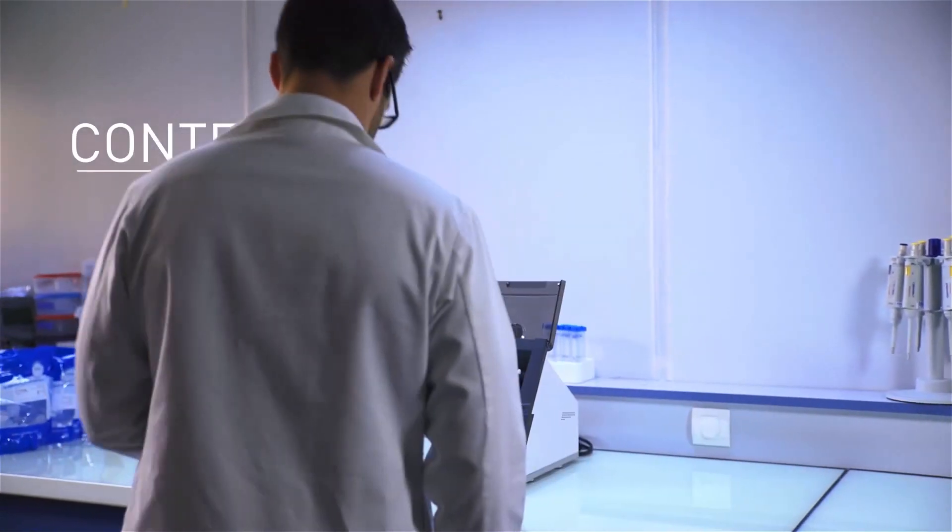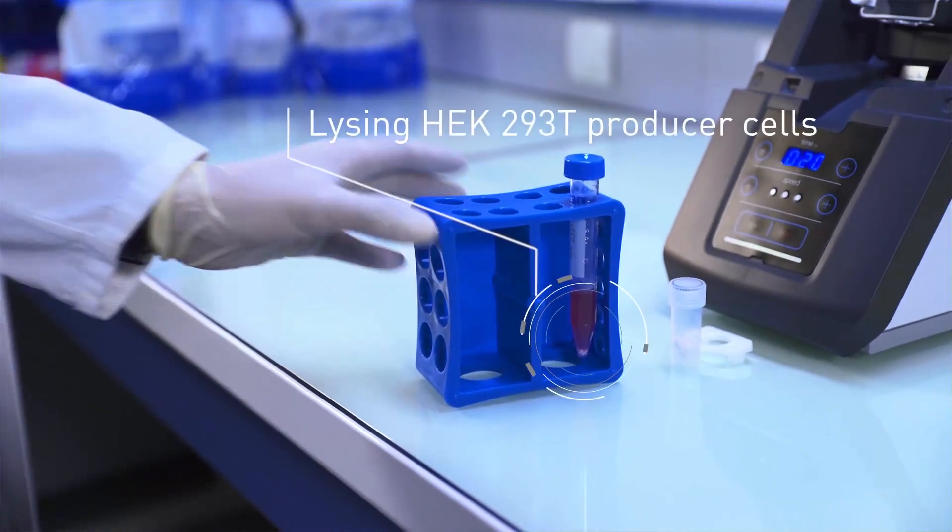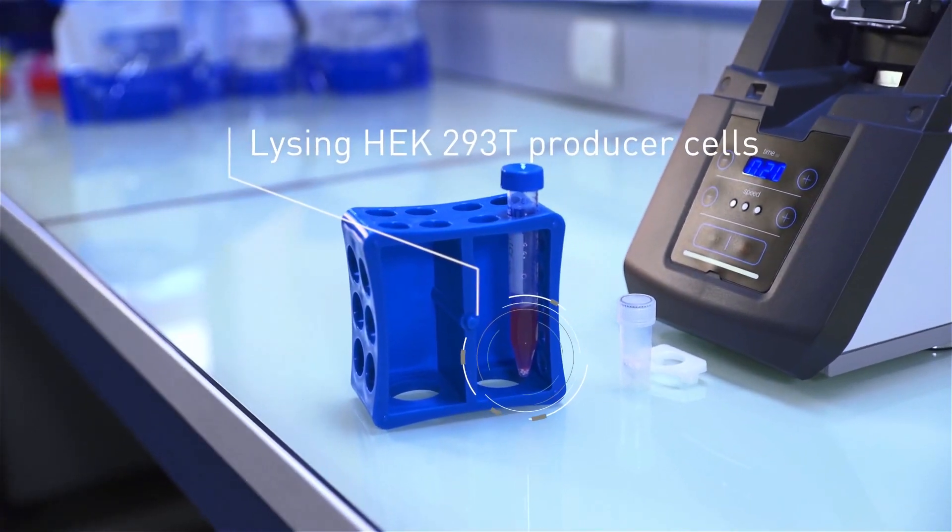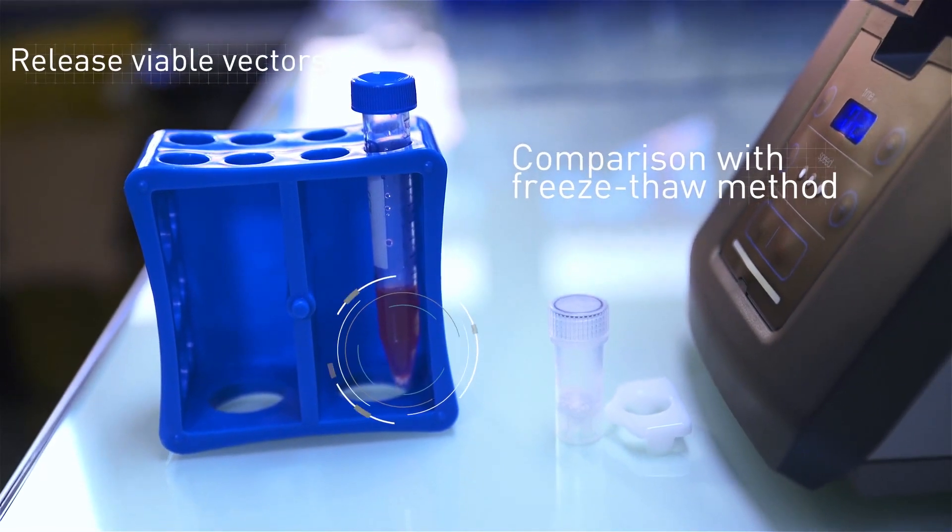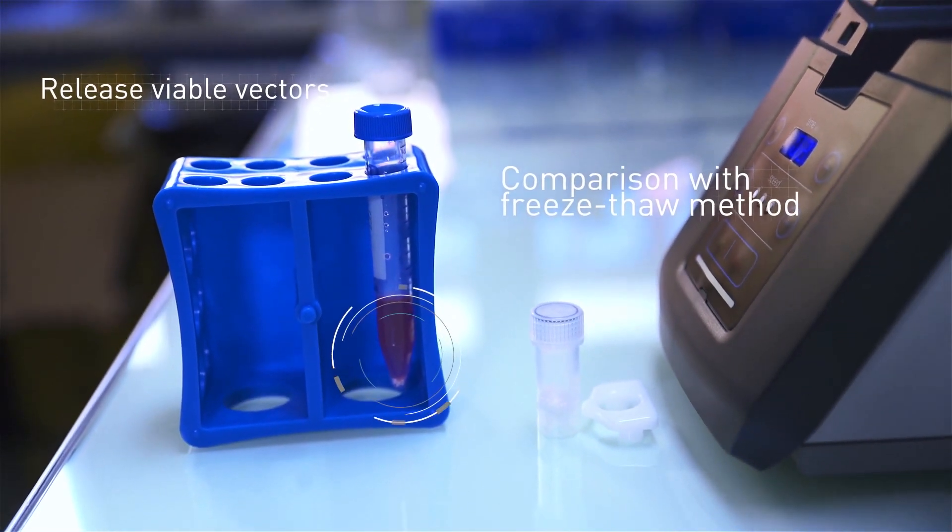The aim of this study is to use the Minilis homogenizer to improve on a method of lysing HEK293T producer cells to release viable intracellular viral vectors.